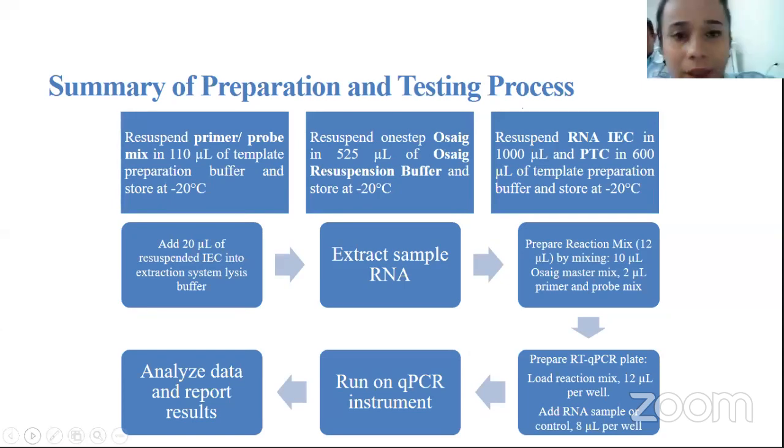So this actually concludes this first segment of today. And I have a few questions. I received a few questions from the participants. So let's discuss those. So the first question is, what are the constituents of master mix PCR?